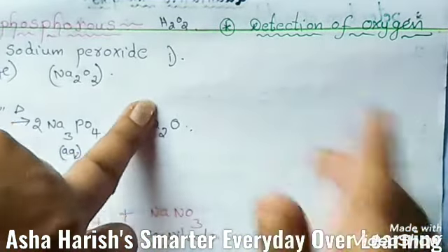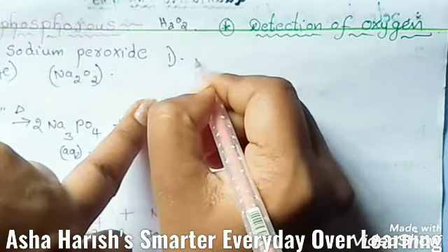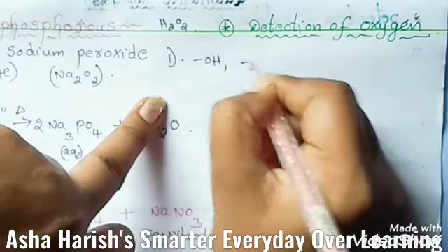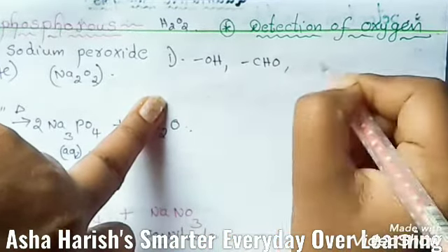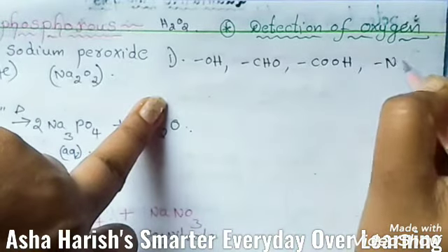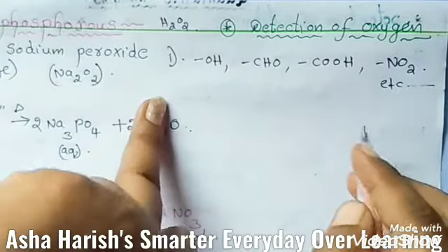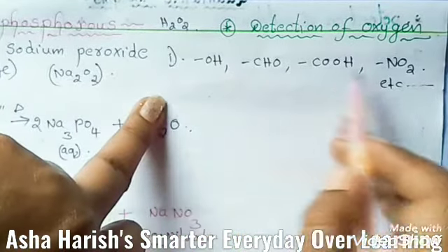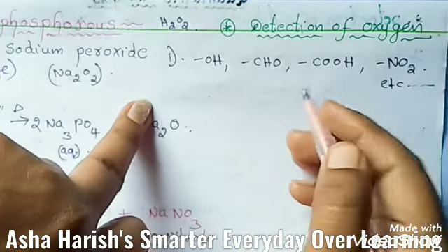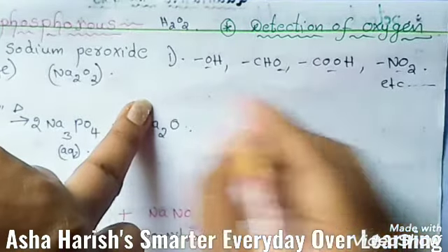The compound is tested for the presence of oxygen containing functional groups such as the alcoholic group, aldehyde group, carboxylic acid group and nitro group. The presence of any one of these groups in the compound in turn confirms the presence of oxygen. You can see here the oxygens are present.